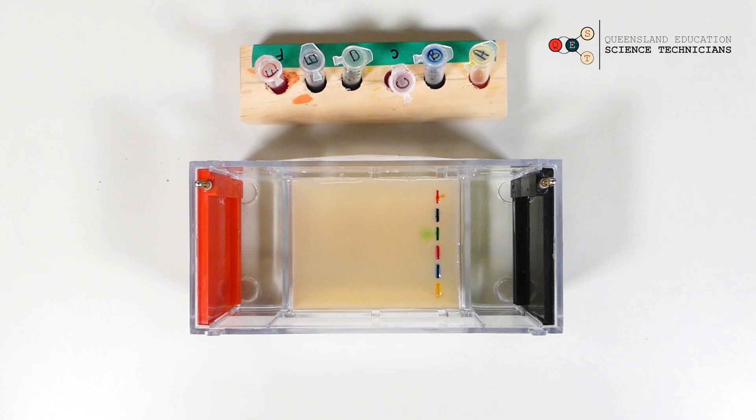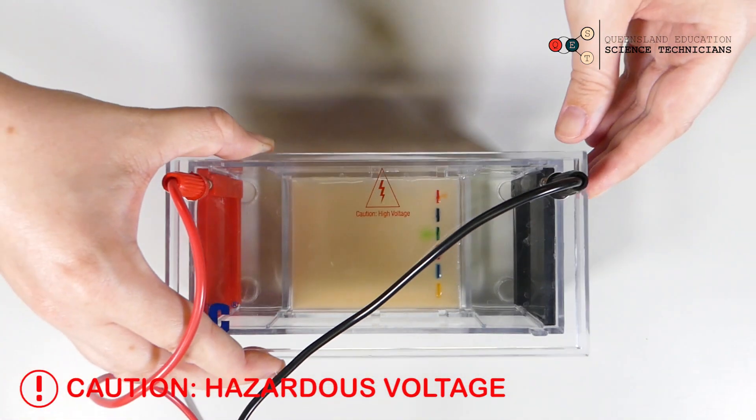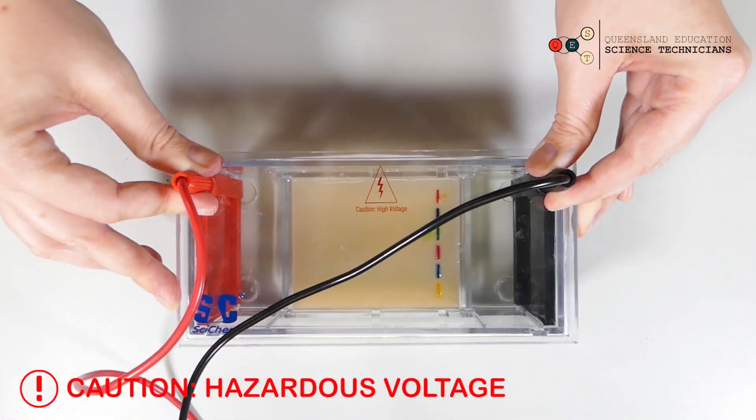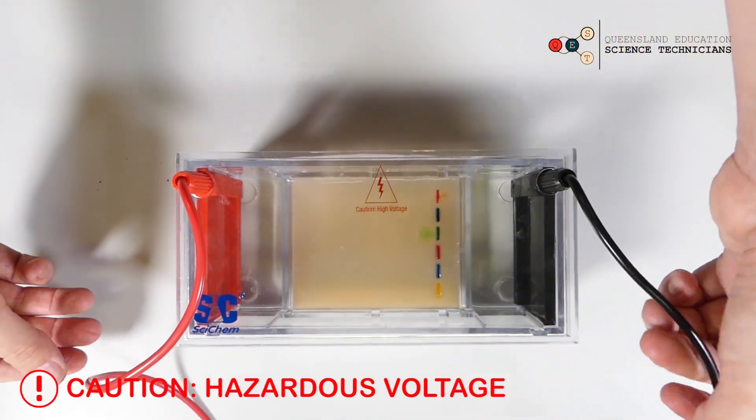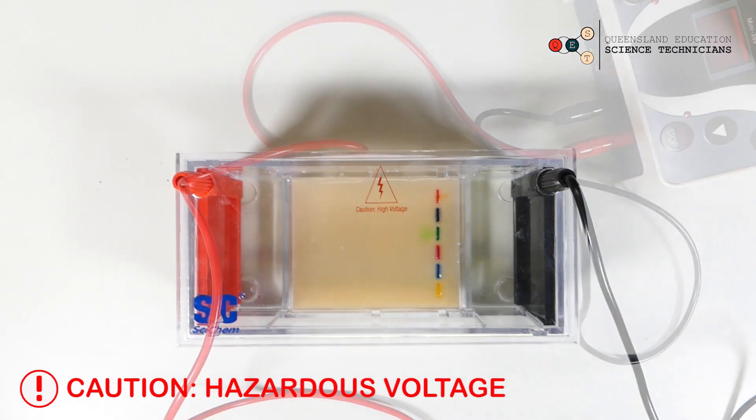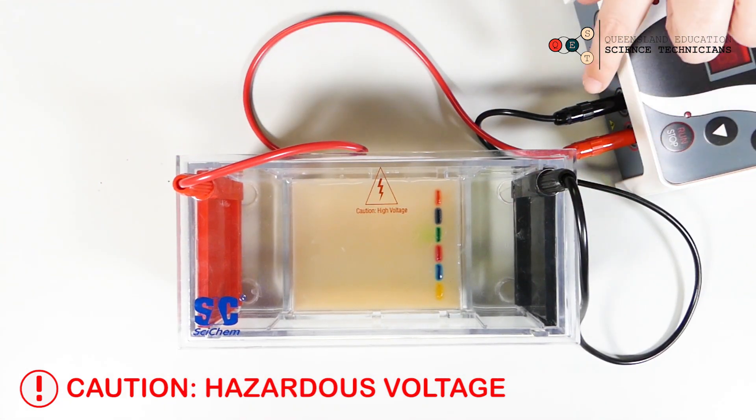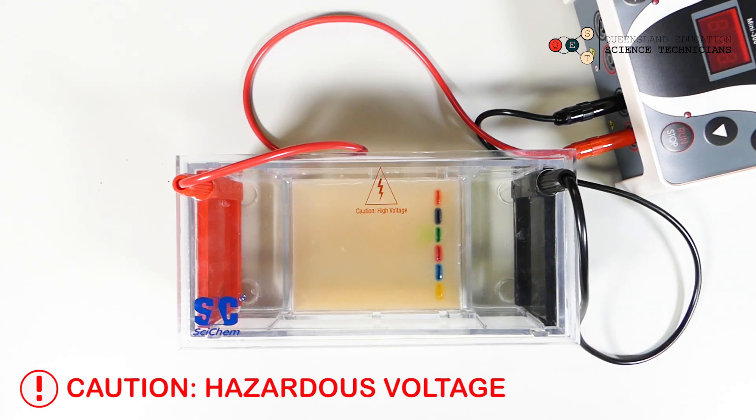It's a little bit messy but that's okay. Now we need to fit the lid of our chamber on. It's black to black, red to red. Hook this up to our power supply. So you've got your lid on, you've connected your leads to your power pack, black to black, red to red. Turn your power pack on.